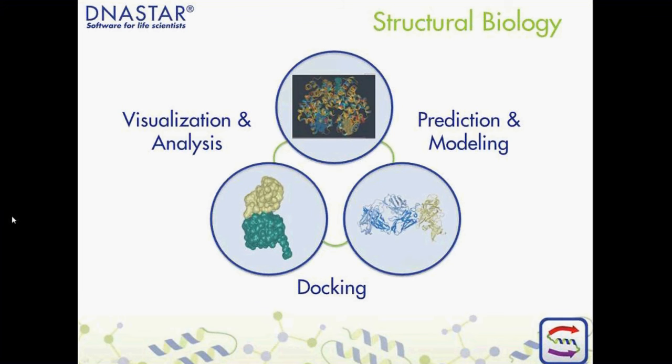In addition, the Structural Biology Suite offers access to NovaFold for protein structure prediction. That's where we'll be focusing our attention today. We're currently implementing protein-protein docking workflows into this suite, but our introduction to this feature will have to wait for a later date.